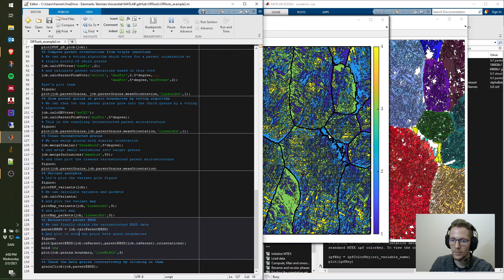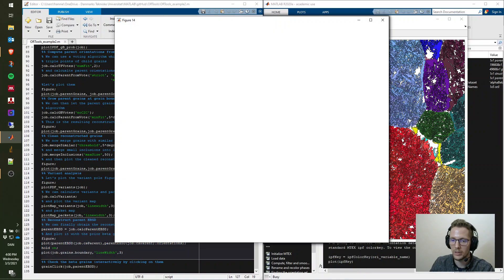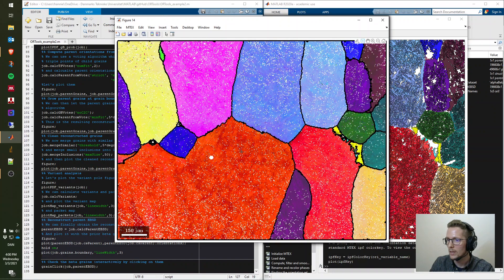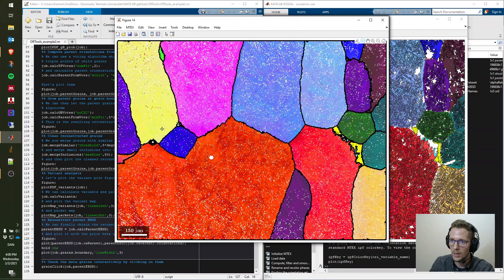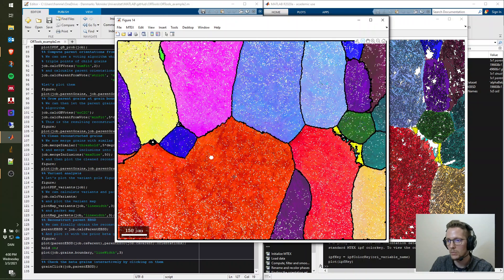In the next step we reconstruct the parent EBSD microstructure using the MTEX function 'calc_parent_ebsd'. The result is plotted with the prior beta grain boundaries drawn as thick black lines and the EBSD data shown inside. This reconstructed dataset can be exported for use in any other analysis.